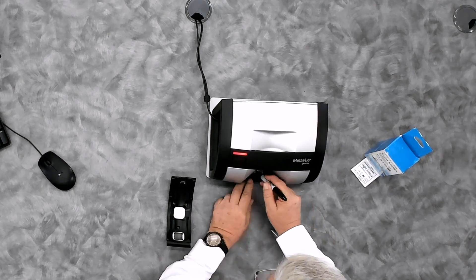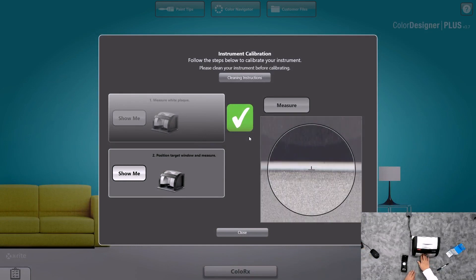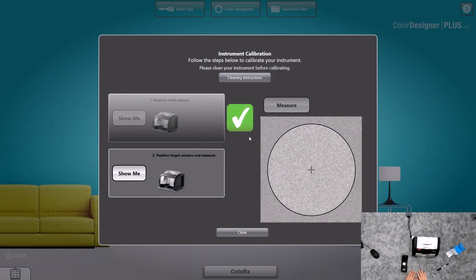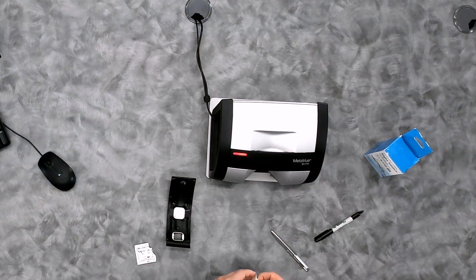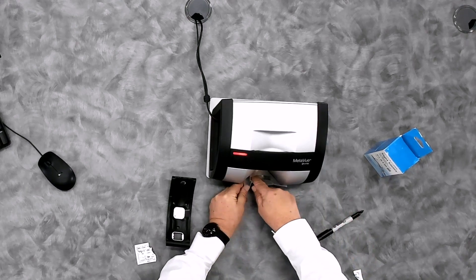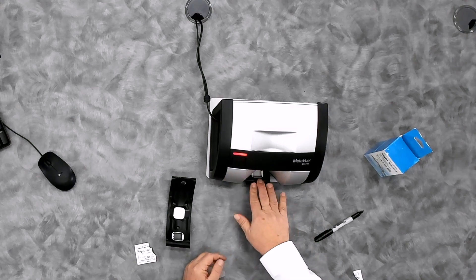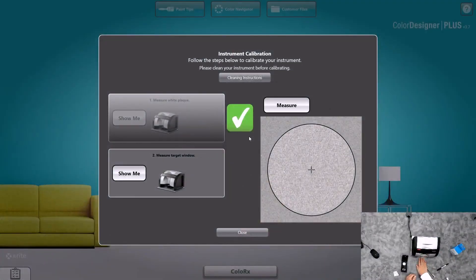I'm going to put a dot from the Sharpie on the rail. I'll slide that back into position for calibration, and you'll notice that the measure button does not illuminate. You may feel it and think it's locked in because there is a feeling of locked in. By looking in there, we can see that there's paint on that rail. So I simply take one of our cleaning cloths that are sent with the instrument — these are nothing more than alcohol wipes if you run out — and clean each side of those target square tabs, the left and right. Make sure those are clean, then place that back into position, and the measure button appears.